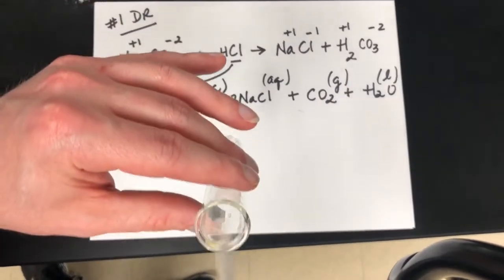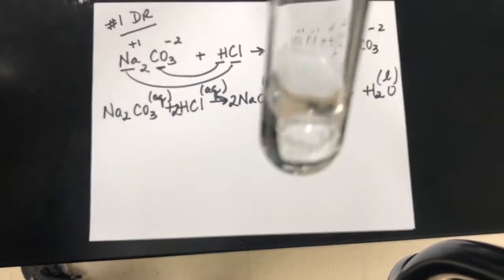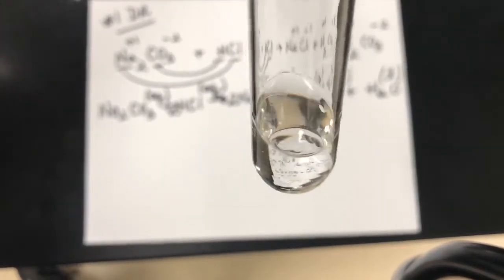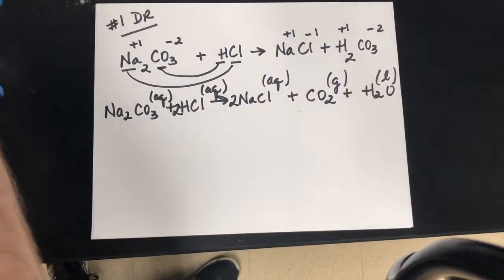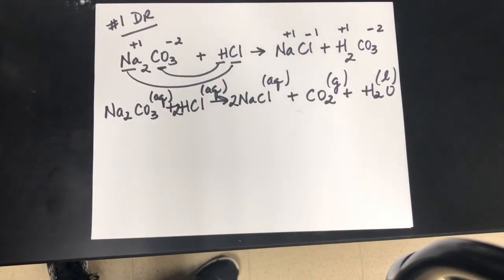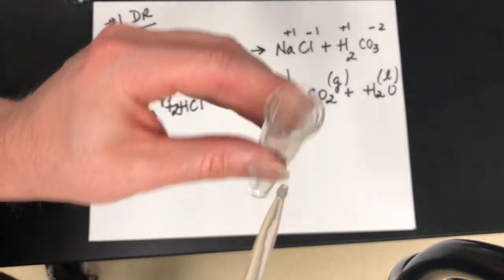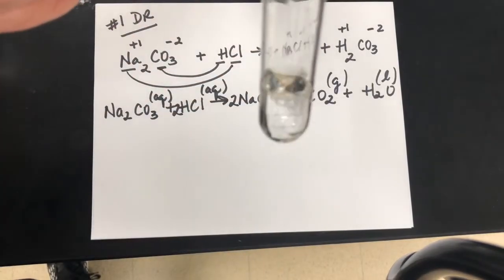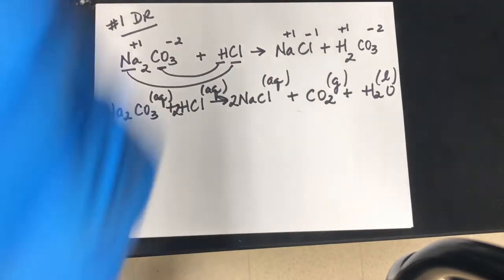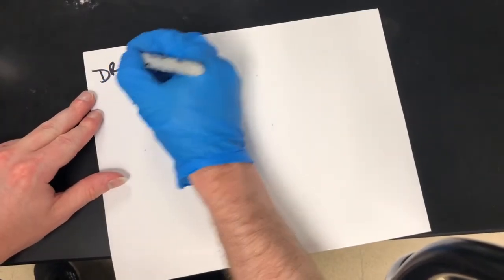So, see the bubbles that went on. Sorry, I couldn't get it up to the camera fast enough. So let's do a little more so we can actually see it happen. And I'm going to add a little more hydrochloric acid. I'm trying to move the camera up real quick. See it fizzed? Okay, so there's evidence of a chemical reaction. That's called effervescence.